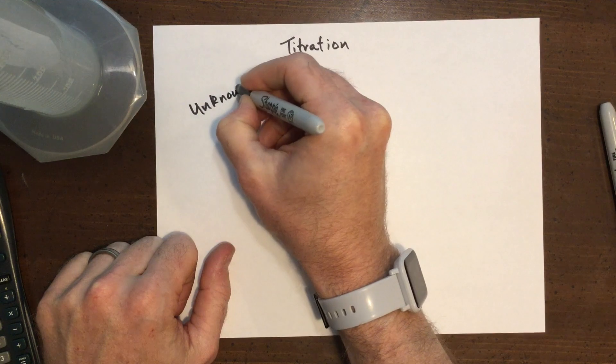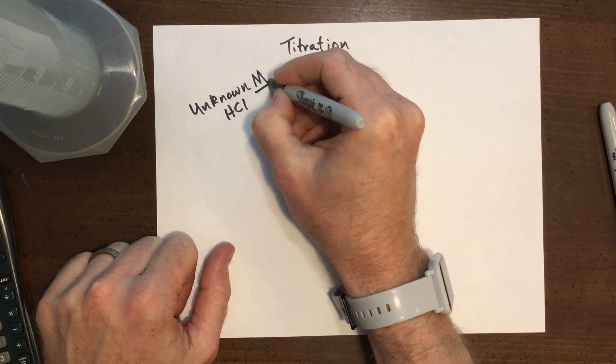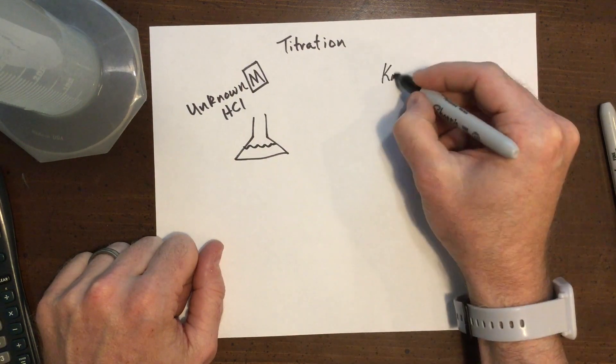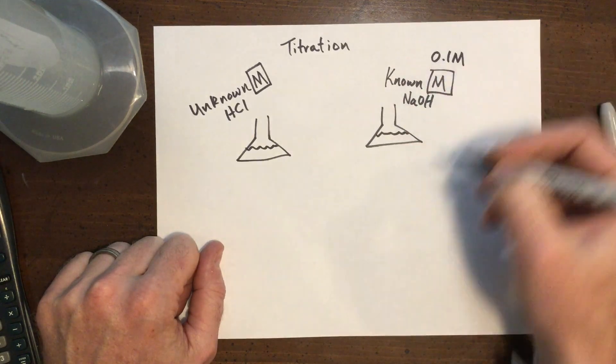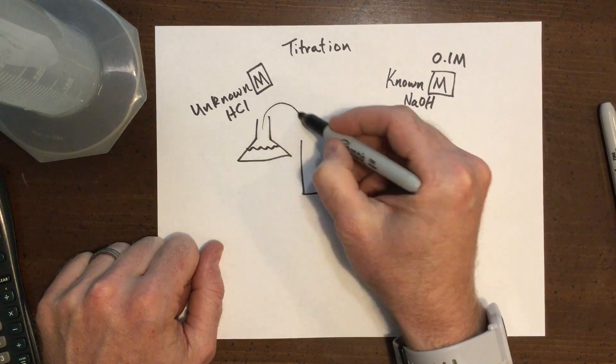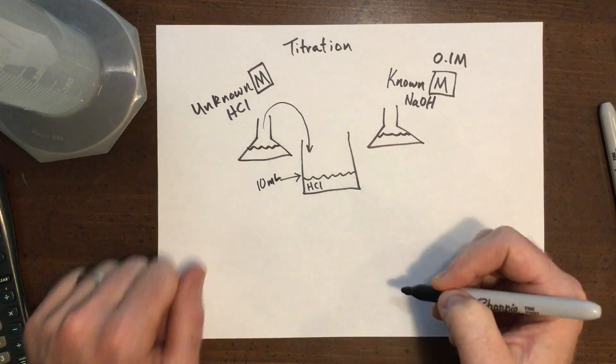Now, in the titration we do, we will have some hydrochloric acid with unknown molarity, and we will have some sodium hydroxide that we know the molarity of. Next, we'll take a set amount of our unknown HCl and place it into a beaker. We'll use 10 milliliters.